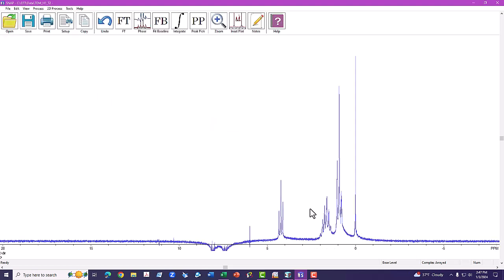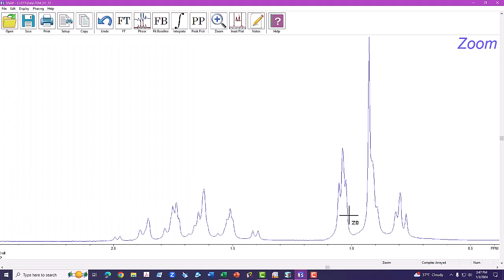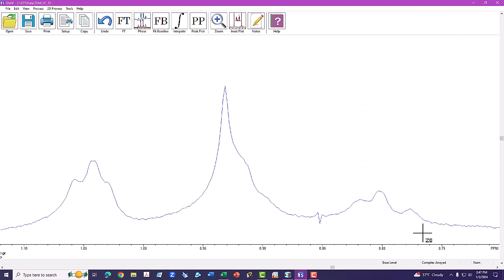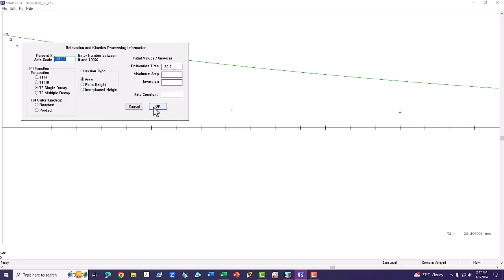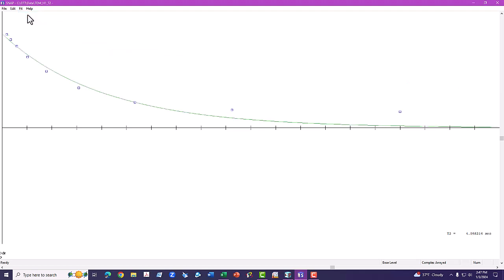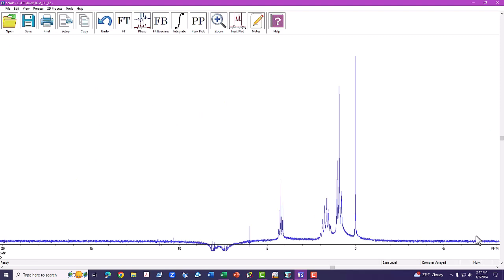Let's do this one more time. We'll go back to slice 1. Broad swipe, narrower swipe, GR, get relaxation data, DR, display relaxation data. Make sure the fit function is set to single decay, and then optimize curve fit. OO. Notice the last 2 points aren't fitting. That's not too unusual. 4.019 seconds is the T2. So in a nutshell, that's how you process T2 data using the SNAP program.